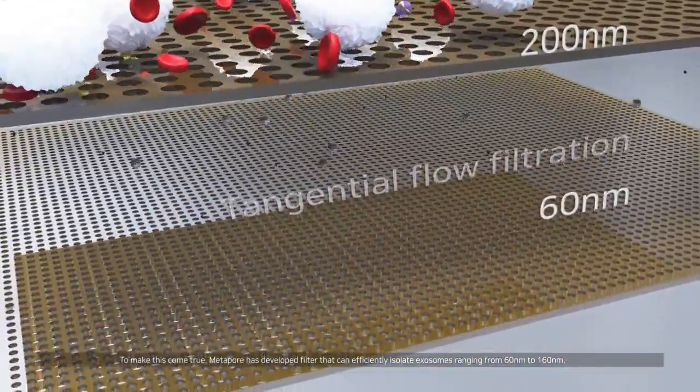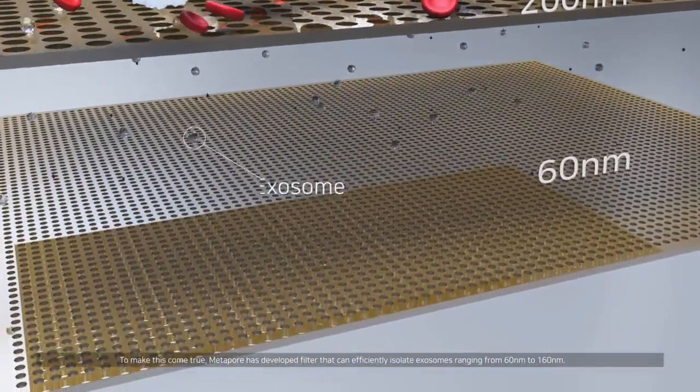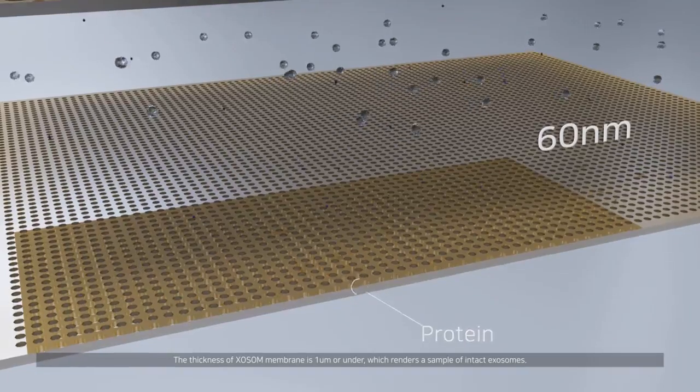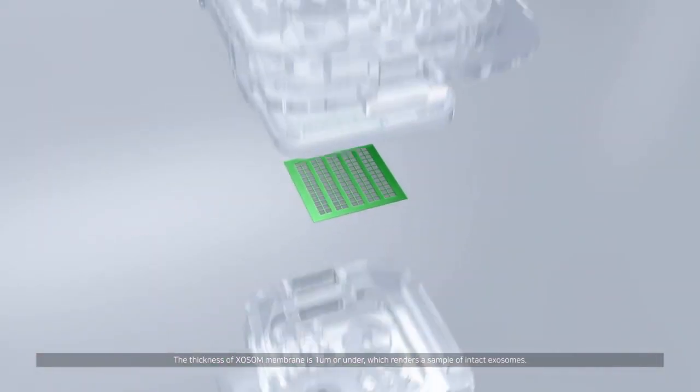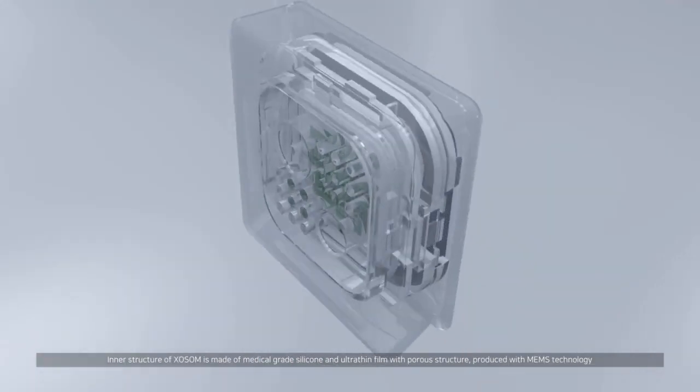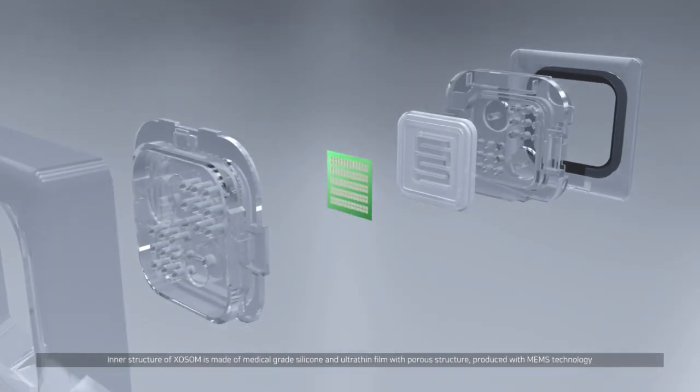To make this come true, Metapore has developed a filter that can efficiently isolate exosomes ranging from 60 nanometers to 160 nanometers. The thickness of XOSOM membrane is one micrometer or under, which renders a sample of intact exosomes.